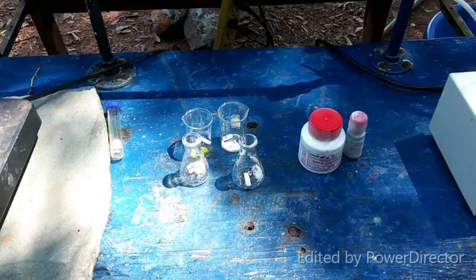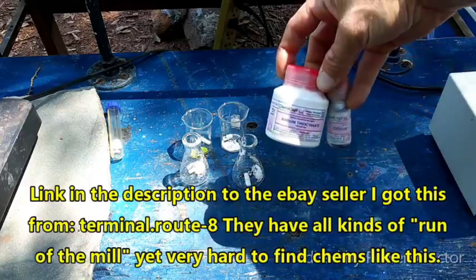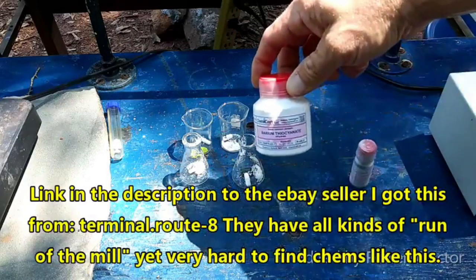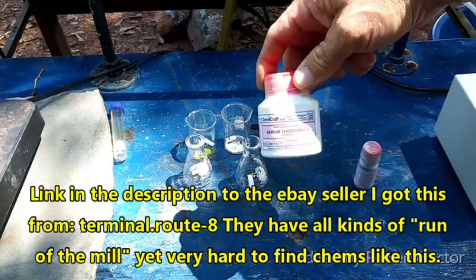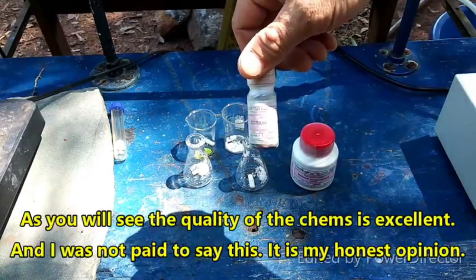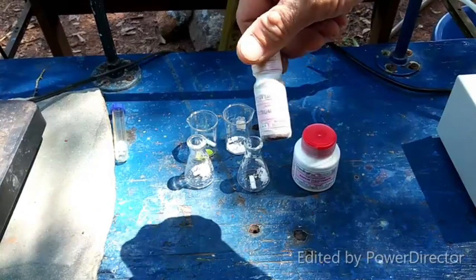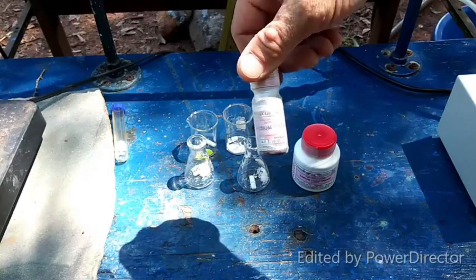Okay, everybody, so here are my new toys that I just got. Some barium thiocyanate, isn't that nice? And some cesium sulfate, yay! Very handy to turn into other cesium compounds.